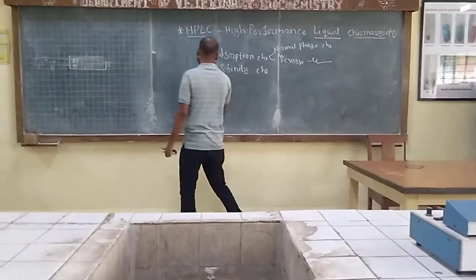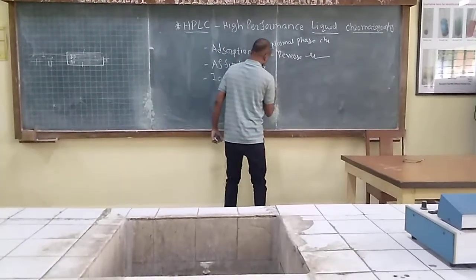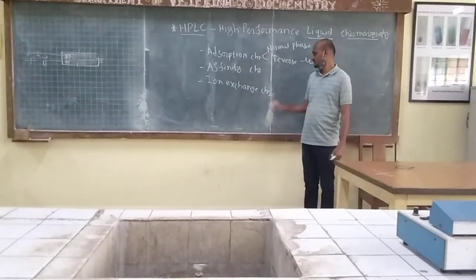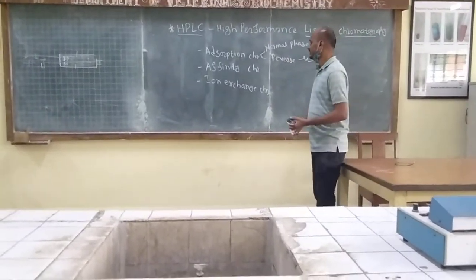Next, ion exchange. Ion exchange chromatography you can do, right? So some ions are getting exchanged, and this we are detecting. So that is ion exchange chromatography. Anything else?